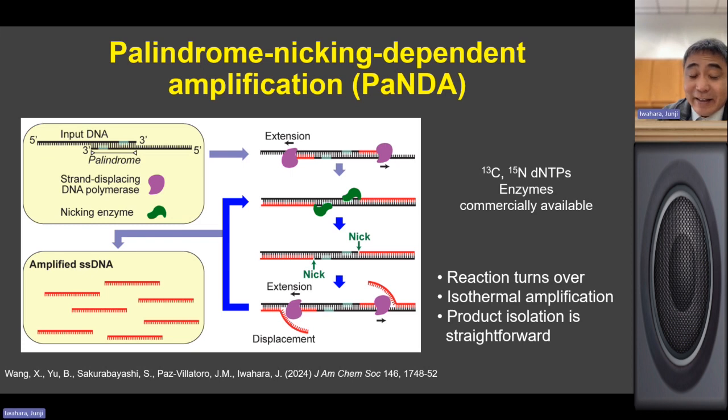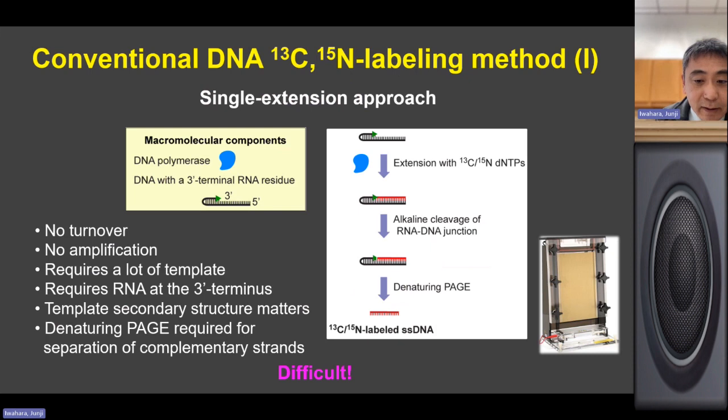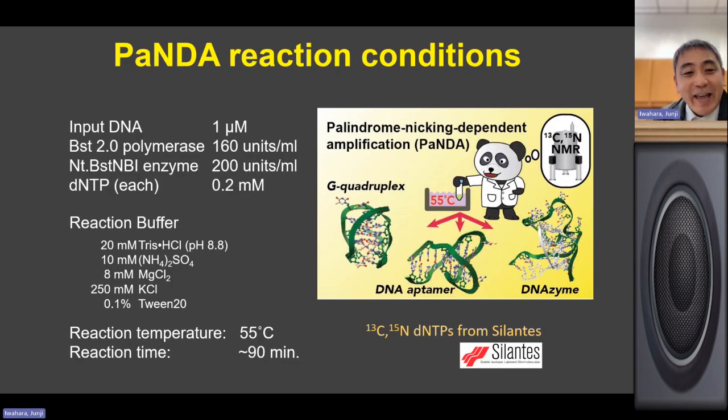And another thing is we tried some other nicking enzymes as well, but the enzyme called Nt.BstNBI nicking enzyme is the best.